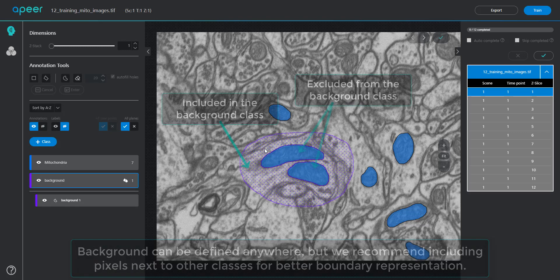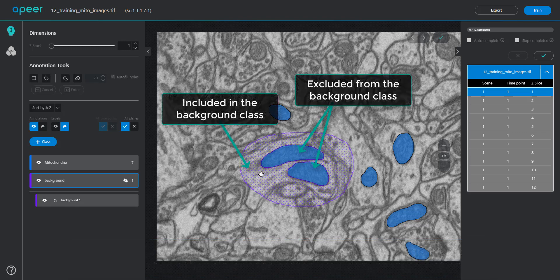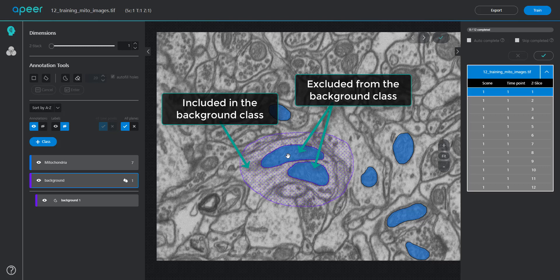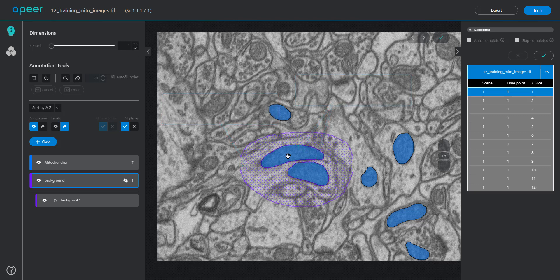This automatically defines the background region by excluding the pixels that belong to any real annotated object, in this example, mitochondria.